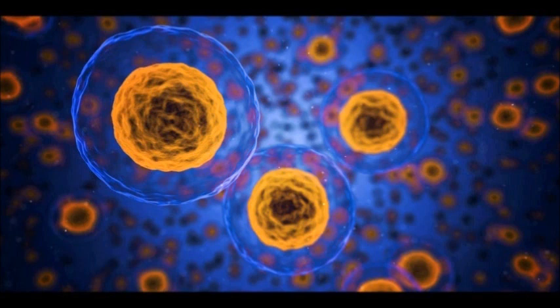and this time I was able to see visible droplets of fatty acids, as well as very large, well-formed fatty acid vesicles under the microscope, which clearly show the double membrane which is characteristic of such vesicles.